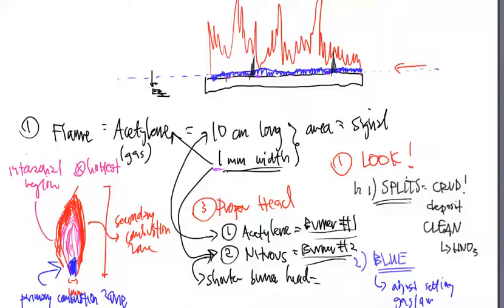The secondary combustion zone is just the reddish-orangish outermost part of the flame. This is the part that flickers back and forth and that can move. And we don't really do a lot of analysis at all through that part of the flame. It's also the coolest. What's funny is that a lot of people look at that red and orange color and think that it's the hottest, but that's actually the coolest part of the flame itself.